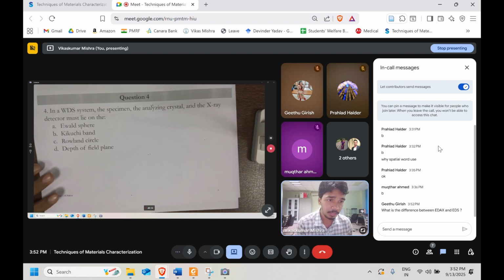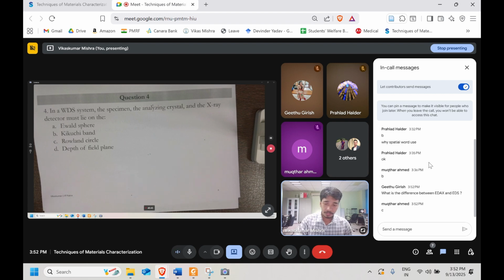So let's try to answer this. What is the difference between EDAX and EDS? See, EDAX is the company name, and EDS is the method, right? People usually think they are the same thing, but EDAX is the company name, and EDS is the methodology that we are using.